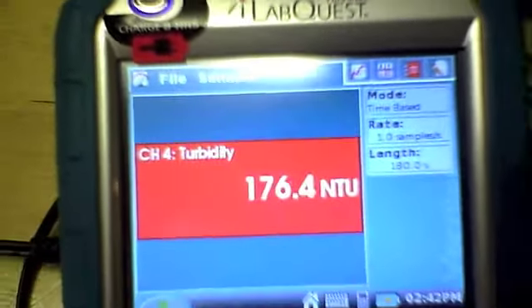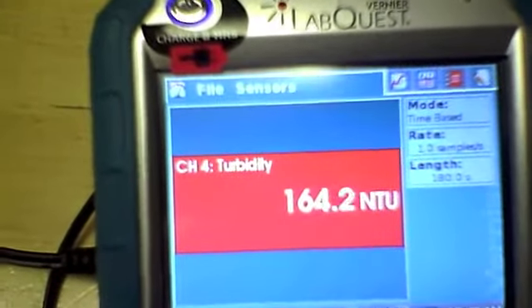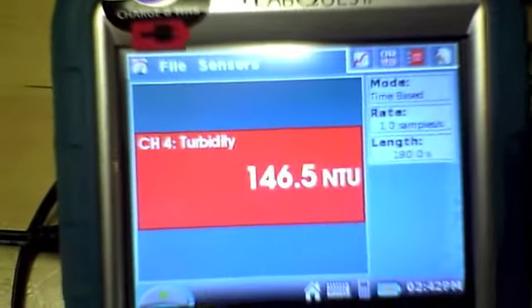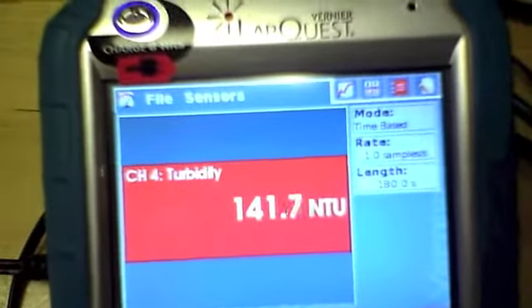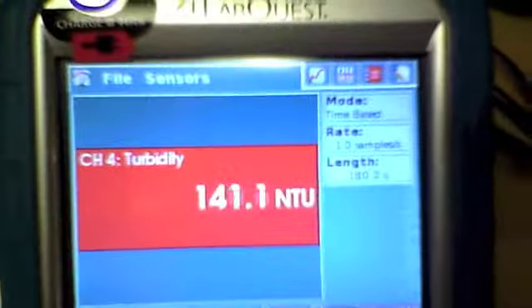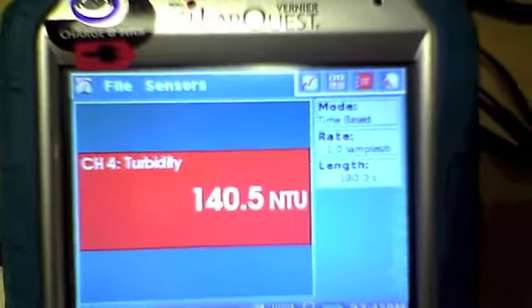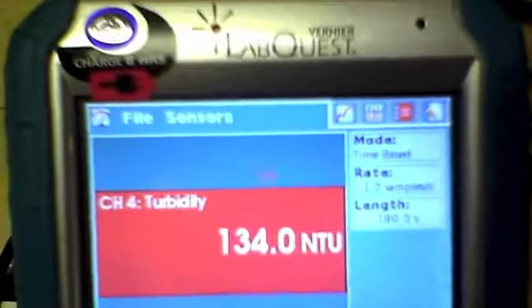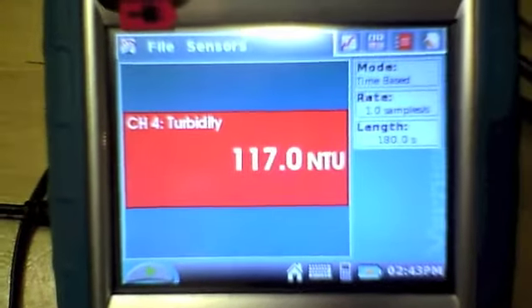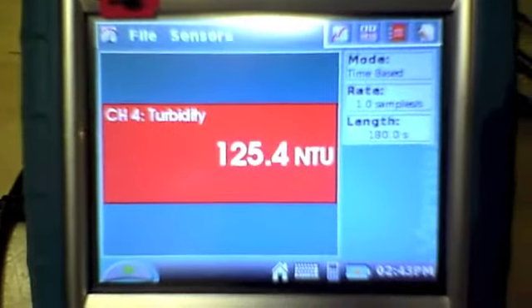You can see now, because the water is settling inside of there, the turbidity level is going down. So if we were to obviously shake up the water, it would be relatively turbid and its appearance would not be aesthetically pleasing. Remember, that was one of the qualities that we were looking for. If we let it sit for our 3-minute time, then we will see the turbidity actually go down. I can sit here and wait for 3 minutes, but I am really not going to do that.